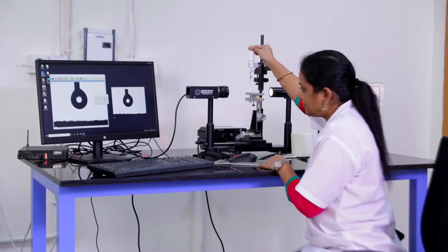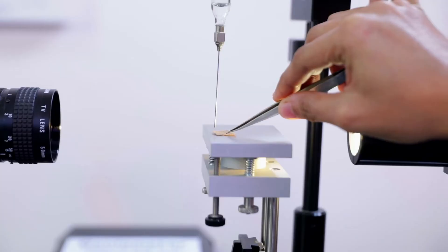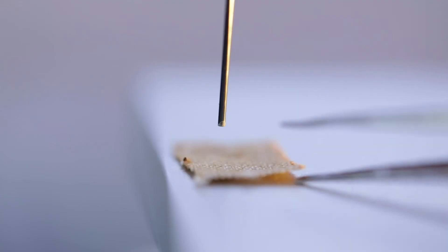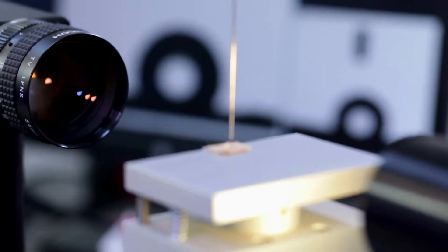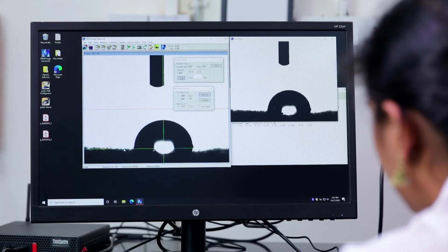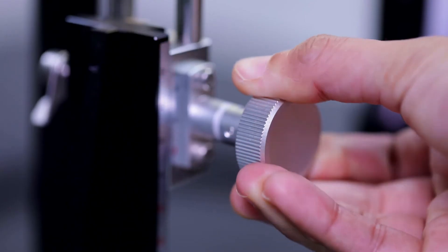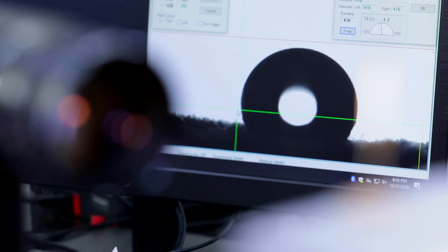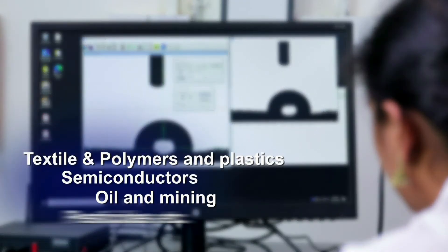The main purpose of a goniometer is to analyze the wetting properties of a surface when a drop of liquid meets a solid surface. This instrument is used to precisely report and record the interfacial tension, contact angle, surface energy of solids and drop dimensions. These measurements are of great benefit to multiple sectors.